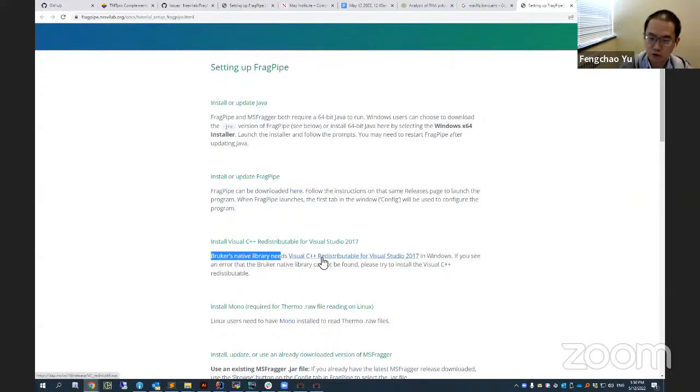We are not allowed to distribute these in our tools because it's a Microsoft library, so please download and install it. And for insufficient memory, even though you have plenty of memory, I don't know the exact reason with this information. I would need to take a look at the log file, or at least the original messages and the settings you have. Also remember to install the 64-bit version of Java, not the 32-bit version.